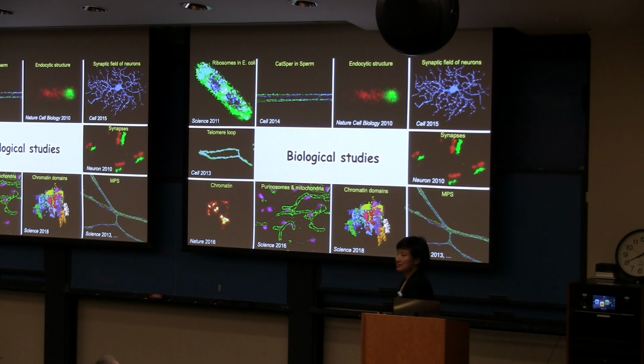Another thing that super resolution light microscopy like STORM inherits from fluorescence microscopy is that it can be very widely applicable to many different biological systems.